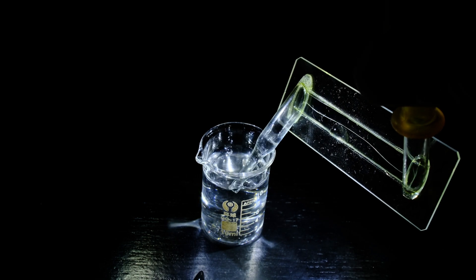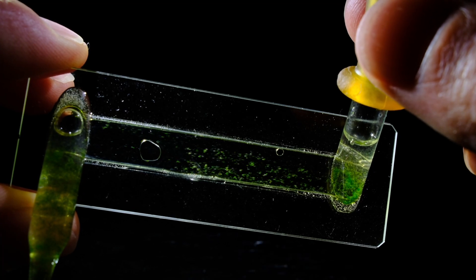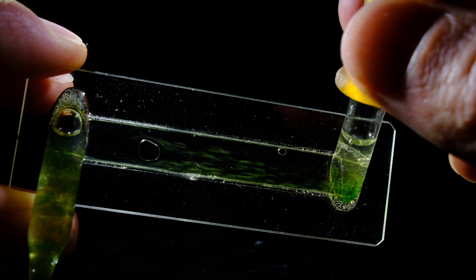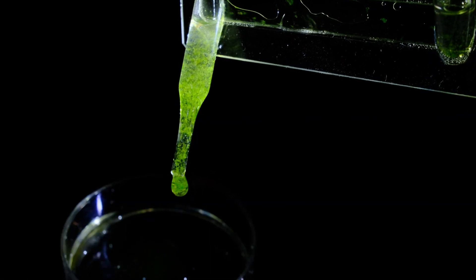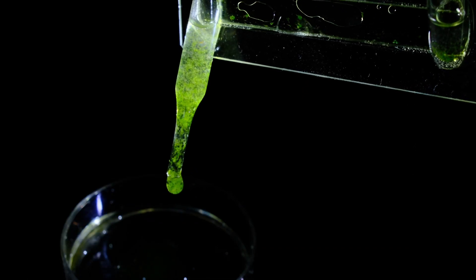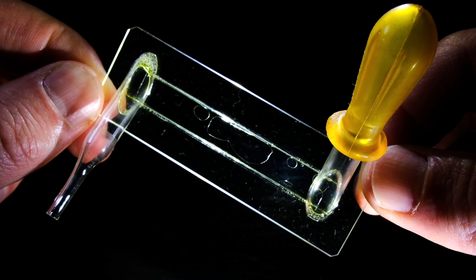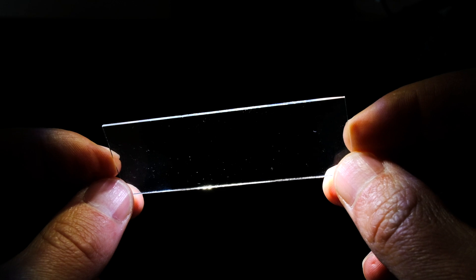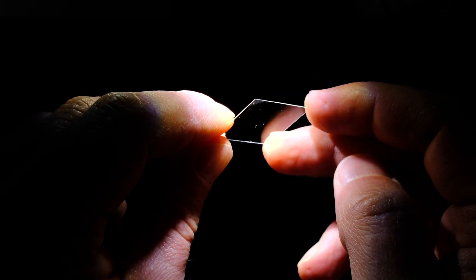This contraption is one of the strangest pipettes in existence, at least in my mind. This frankenpipette fuses three separate pieces of equipment needed for microscopy into one. Usually, you need three pieces of glass: a glass slide, a coverslip, and a pipette to transfer liquid in drops.